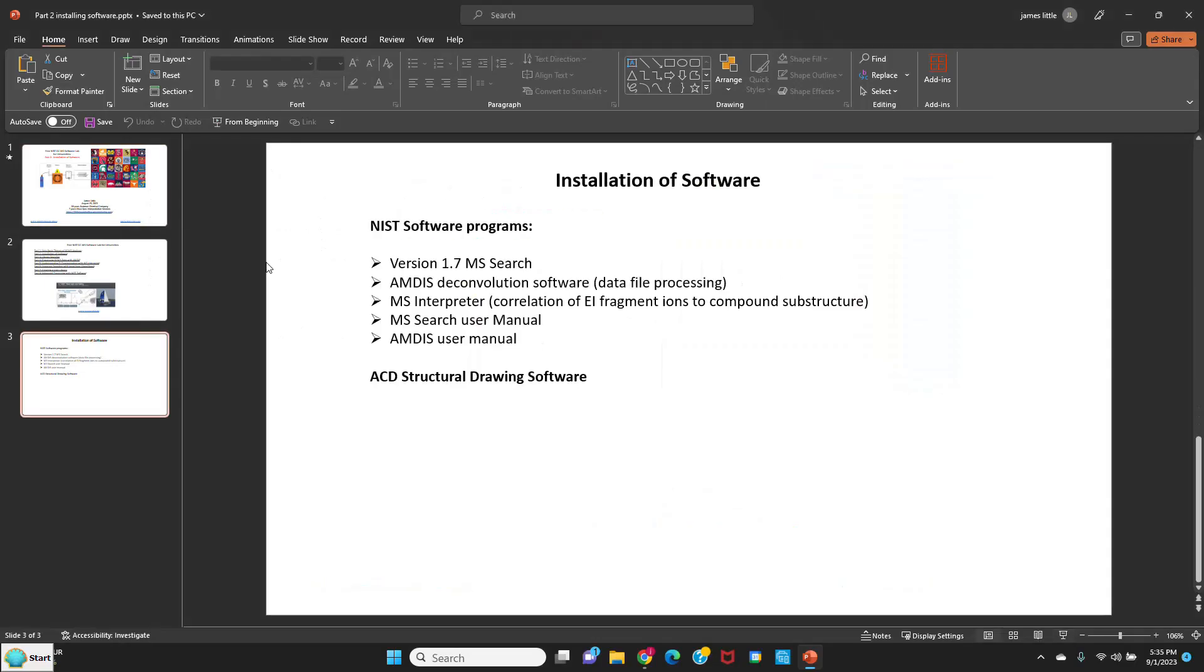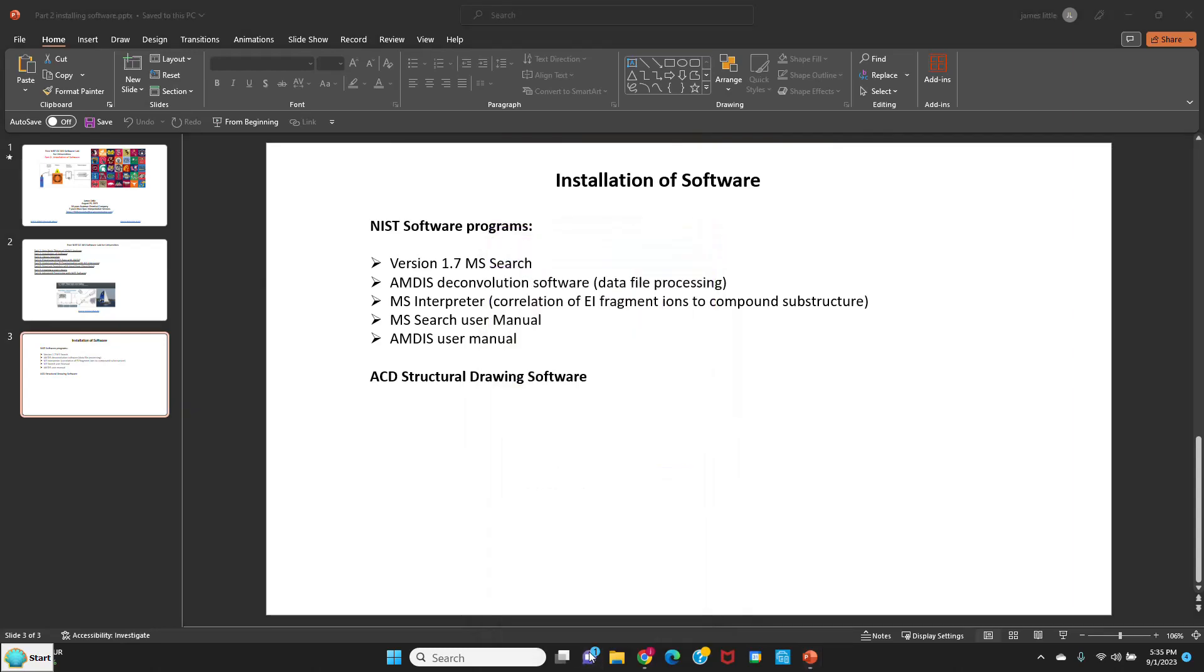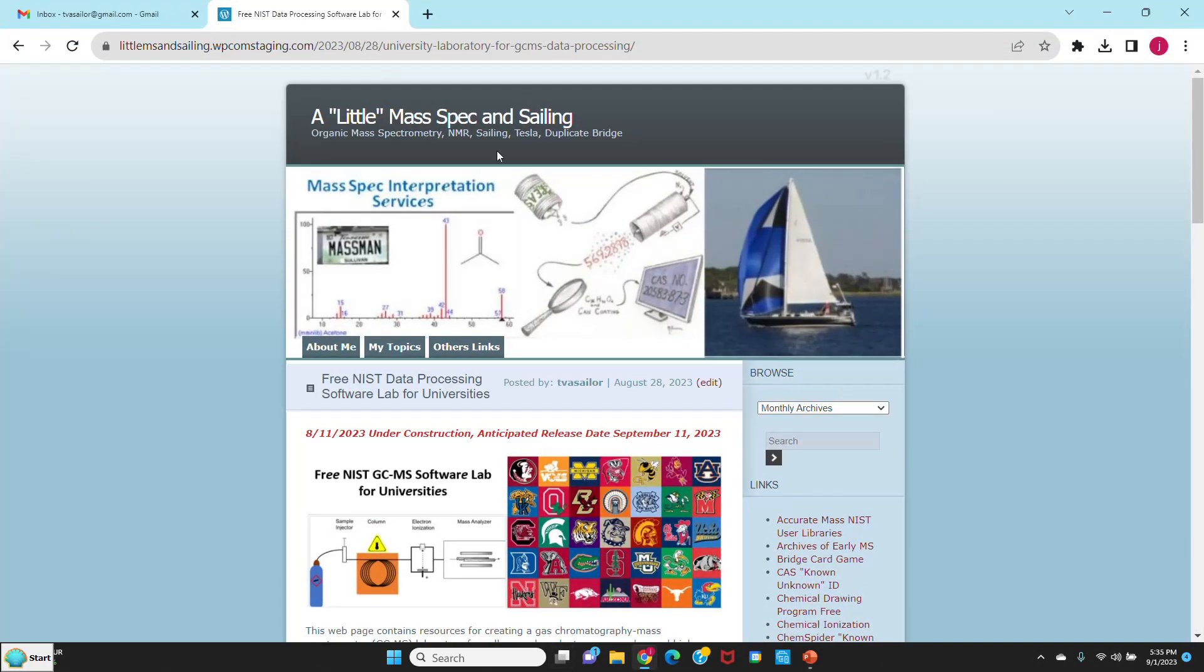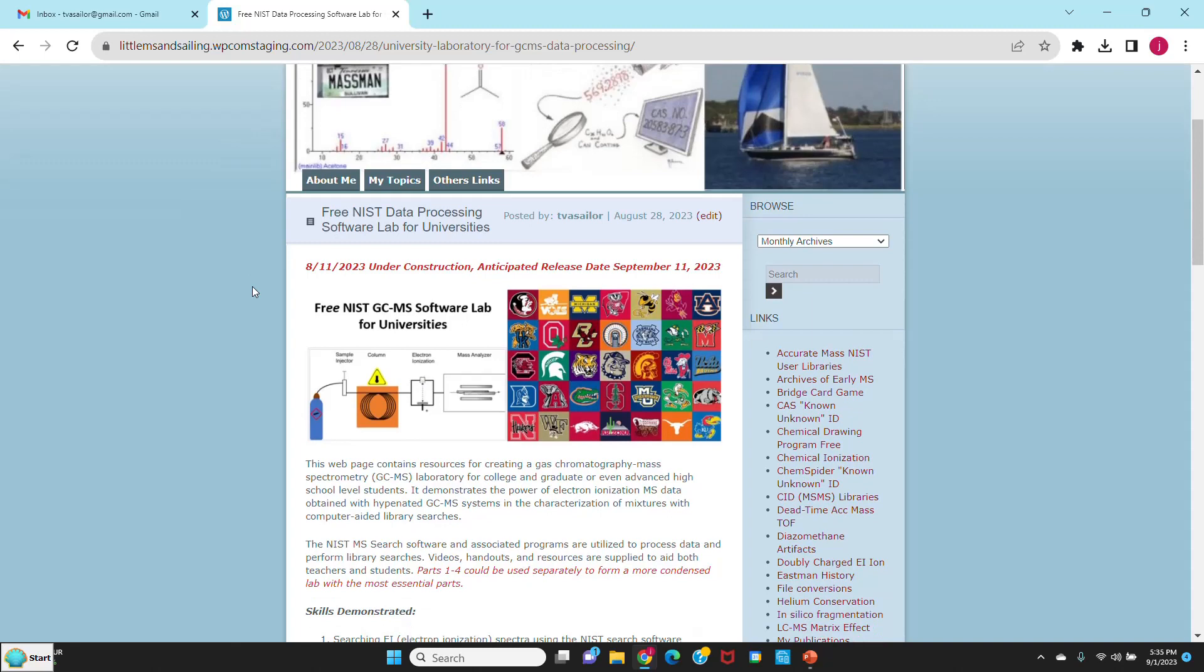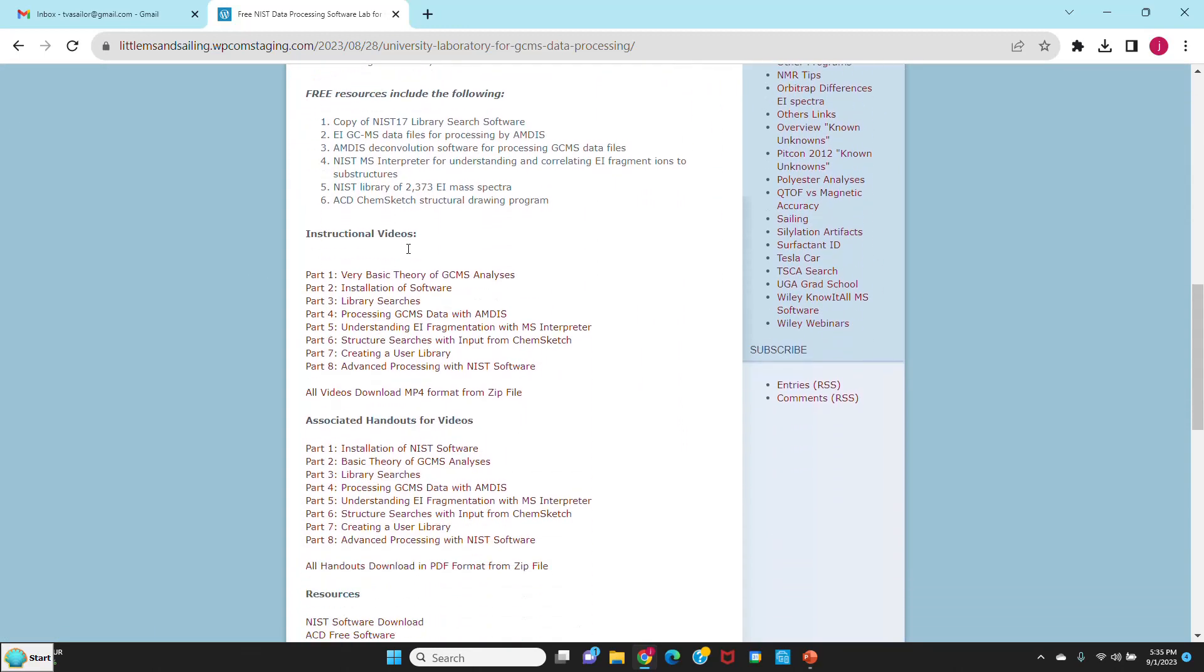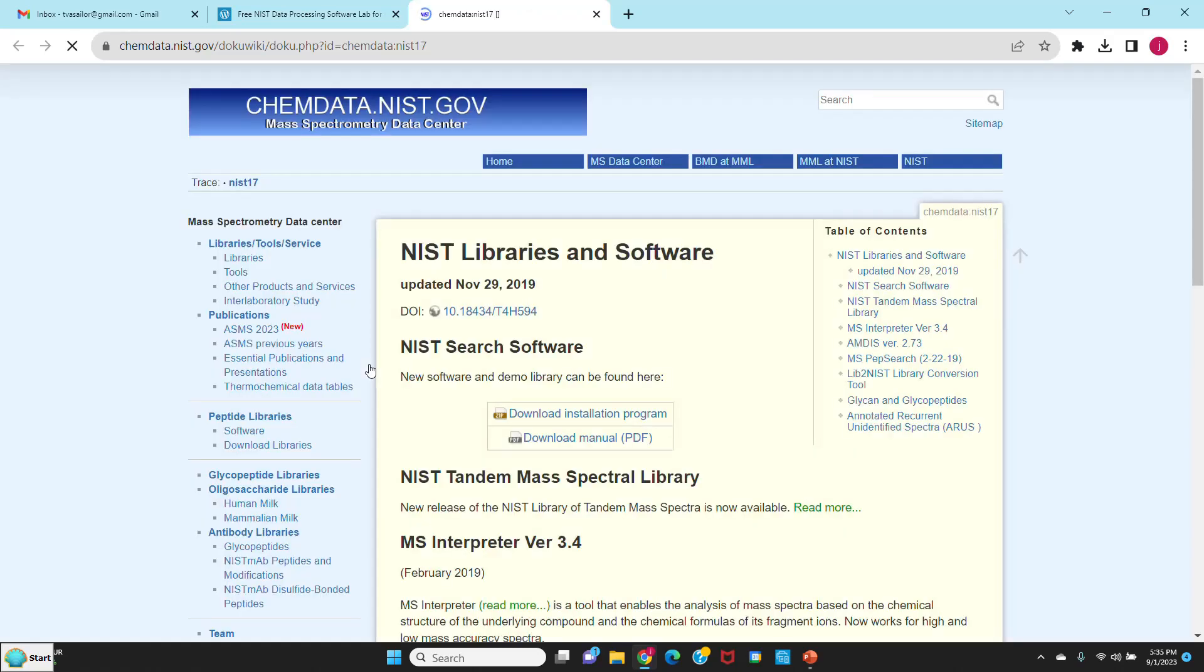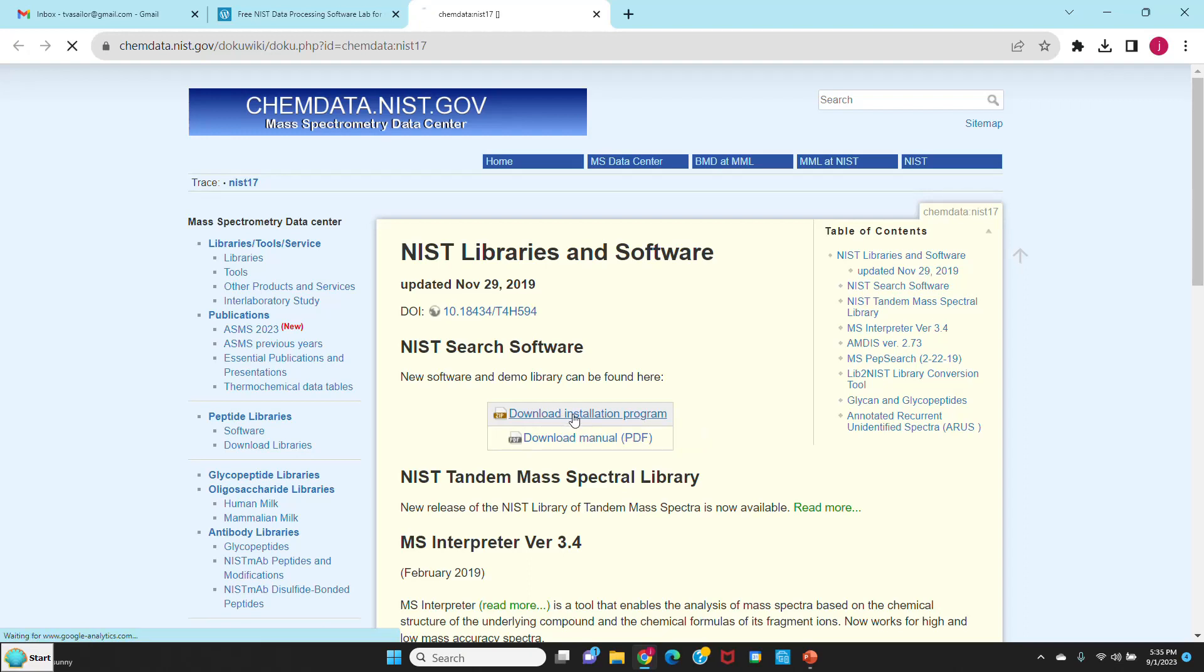So let's go and download the programs. We'll go to my web page, mass spec and sailing, and find the entry that talks about the software lab for universities. We'll scroll down until we find the resources and one will say NIST software download. I'll click on that. It carries me to the NIST page where we'll go down and you'll see one that says download the installation program. You don't have to load the manual because it'll come with the installation program.